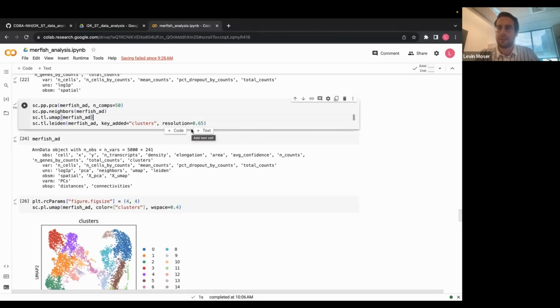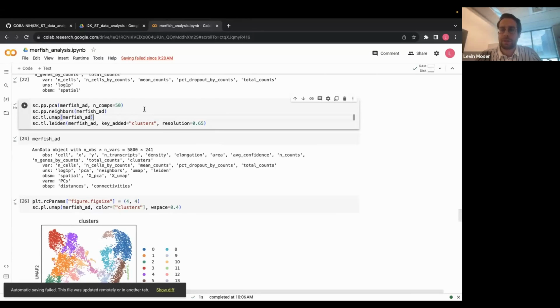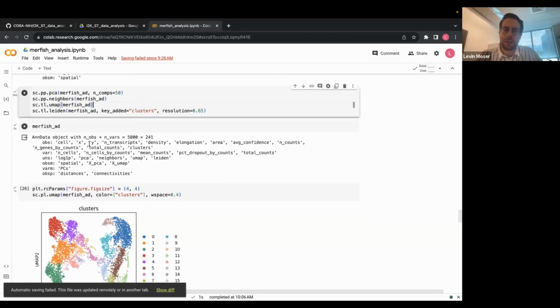For example, with t-SNE, you can actually take random noise, so dots that were generated randomly, and throw it in a t-SNE algorithm and it will give you perfect-looking clusters. So it will attempt to make sense out of nonsense. So with these clusterings, it's always something to be a little bit careful or skeptical with. But unfortunately, I can't really give you a hint on how to choose that.